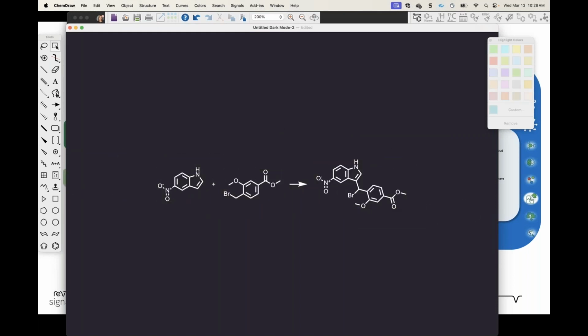And what you see is not only do we have a dark background, but we have a light foreground. So anything that we start doing with our drawings is going to have that same contrast unless you choose to change it, of course. So any text that you would put on the canvas, you'll be able to see in that white foreground and be able to view quite easily.